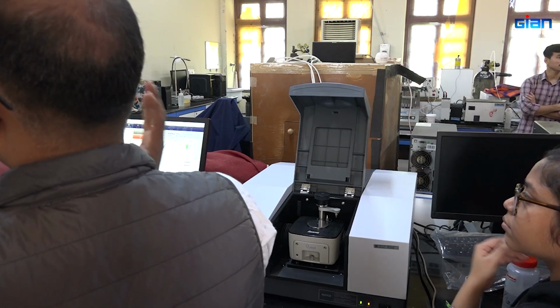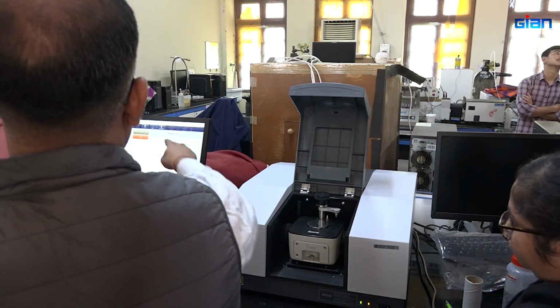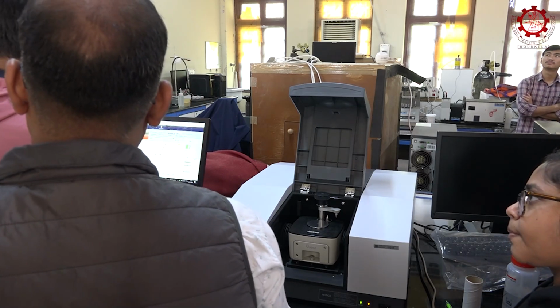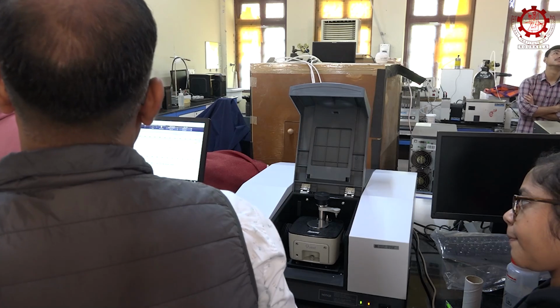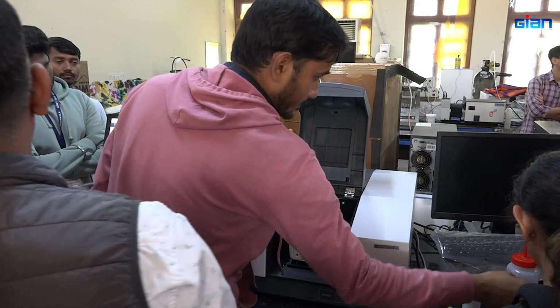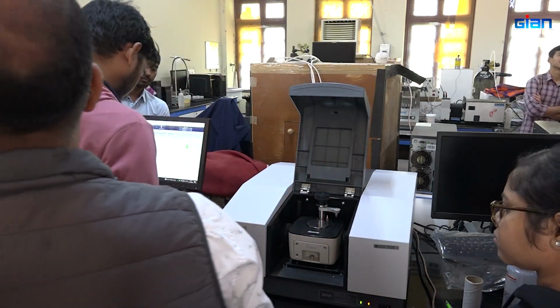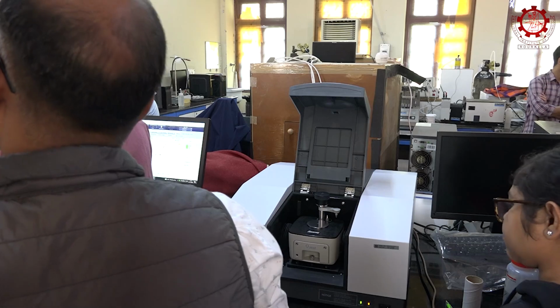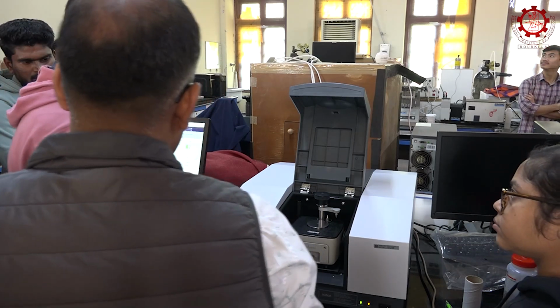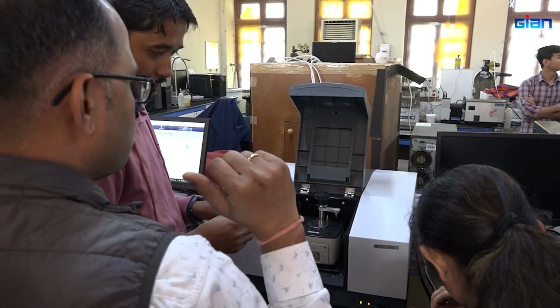Okay. You can always ask questions if there is any confusion. Okay. So now you see that is something we got, and we will place our sample now, right? Or you are waiting? Okay. So you see without the sample we got something, and that is not our information which we need. We need only the absorption by the sample, by the molecule we are providing. Okay. So yeah, so now you see what we are trying to do.